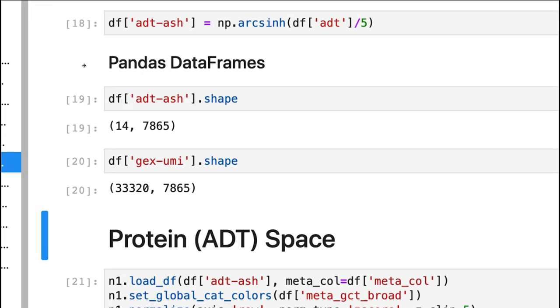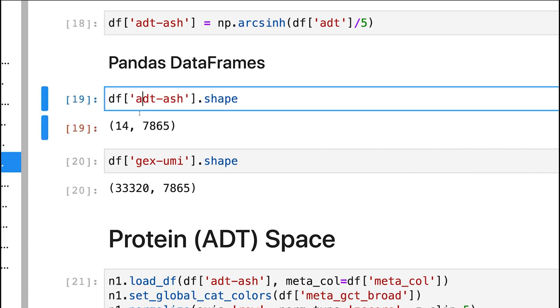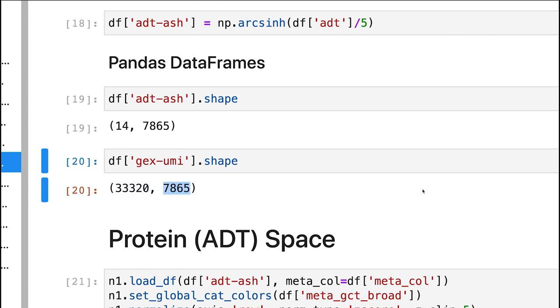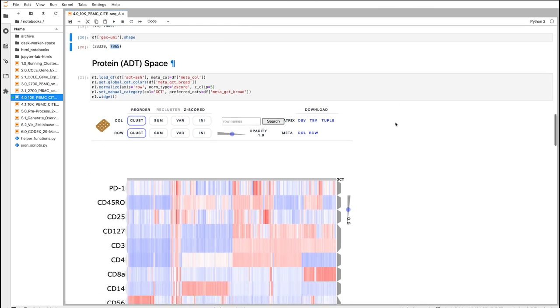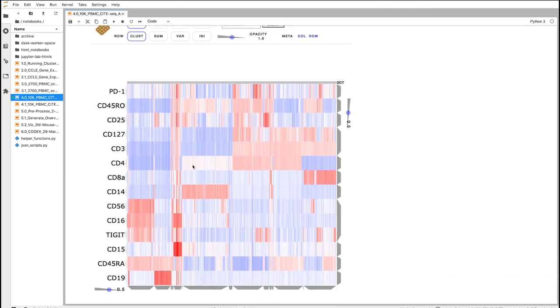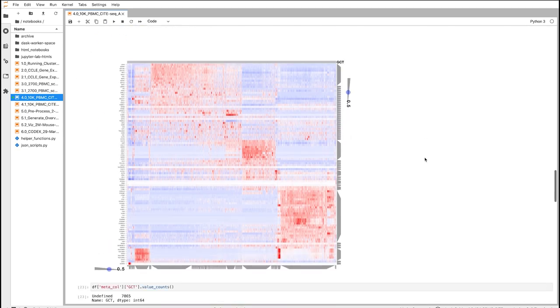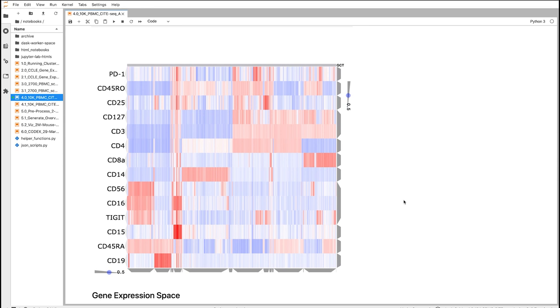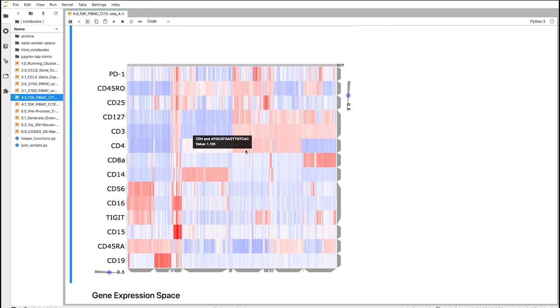We start off with two different pandas DataFrames: 14 proteins and 7,865 cells, and then 30,000 genes and 7,865 cells. We went ahead and used ClusterGrammar to visualize the protein space here — you can see there's a lot of structure in our data. Here we visualize the gene expression space in the top 100 variable genes. This is the same data, but it's two independent measurements of exactly the same cells — a unique dataset to work with.